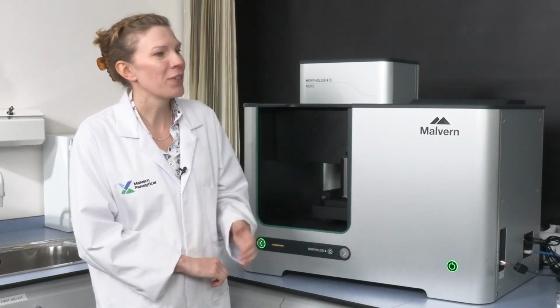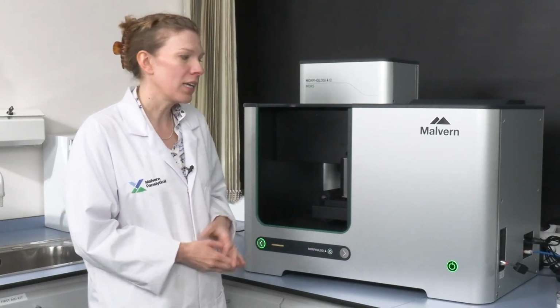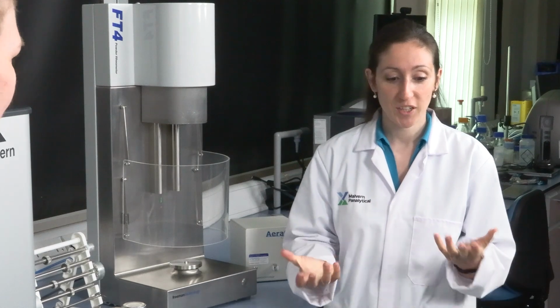Right, so the FT4 can tell you about the net effect of any differences in size and shape, or it can look at the similarities and show that they're the same. That's right. So for example, you can have two different powders that have different size and shape. One of them can have larger particles, which tend to flow better, but maybe more regular in shape. And the FT4 can inform you about whether that powder, despite those differences, is still going to be processable or if it's likely to give you issues in the processing line.